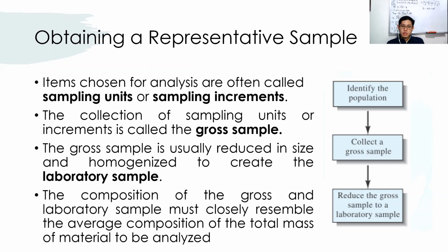And then, yung gross sample mo, dito na kapag nag-partitioning ka na, ito na yung magiging laboratory sample mo. Minsan, yung mga samples mo kailangan hino-homogenize din para mas lalong maging representative of the whole. So, for example, halimbawa, nagpapalit ka ng vegetables.